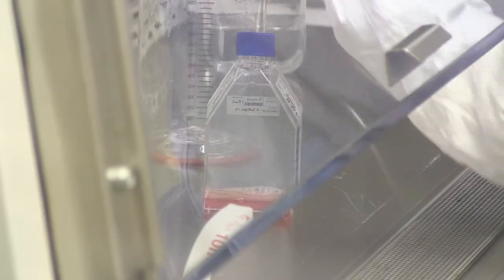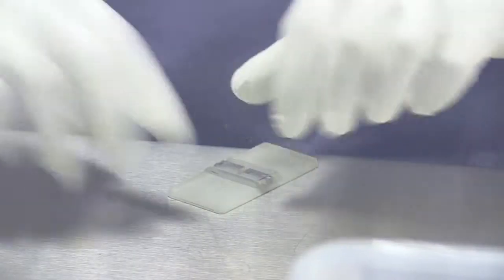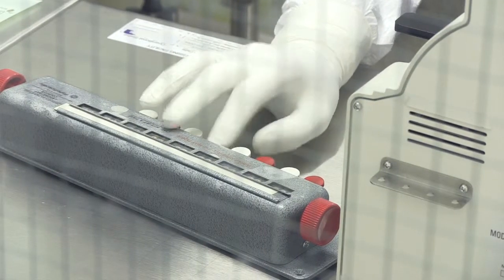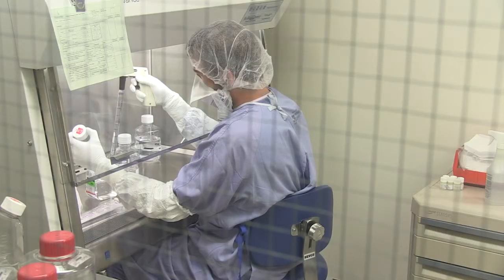They stay in a very small number of cells in little tiny flasks for about a week, and it's at six or seven days where we finally have enough cells that we can actually physically go in and count them. We can pull a sample and load it onto a microscope and see how many cells we actually have — and that's the first chance we get to see how we're doing and our first step where we actually start scaling the culture up, increasing our volume and getting more and more cells.